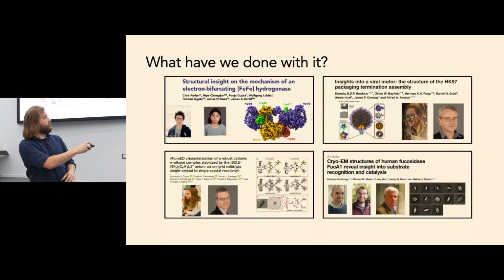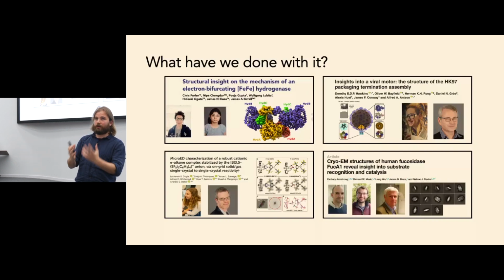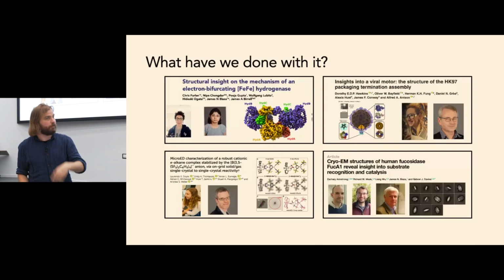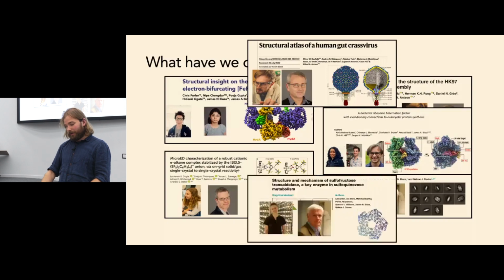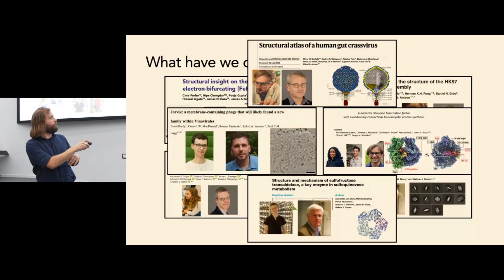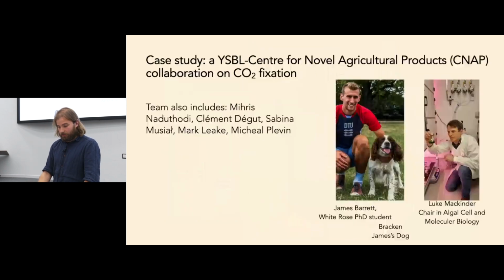We've done, and this is Hugh Jenkins, who's led on actually doing stuff that isn't even biological by doing microelectron diffraction. For that, he has to stay up till the very early hours of the morning just collecting data. We've looked at the most abundant phage in the human gut. We've looked at how ribosomes hibernate. We've done a bit on sulfur sugars, and Pavel's even isolated a virus that he's called Jorvik, after the Viking name for York.